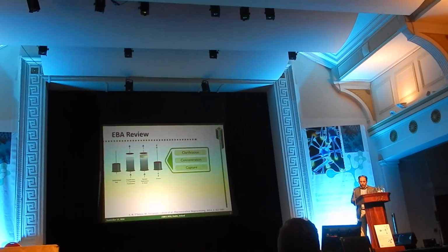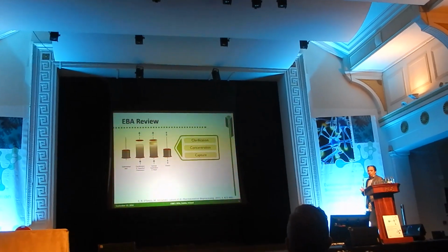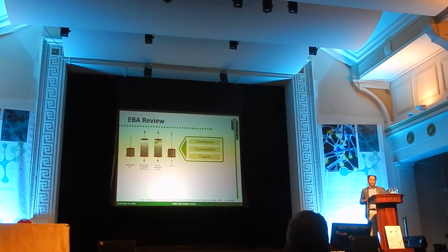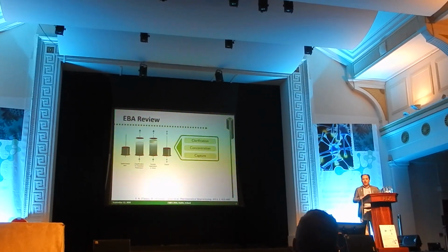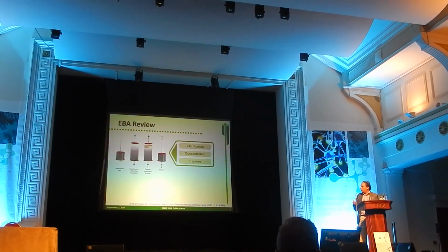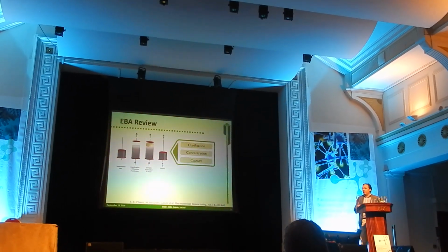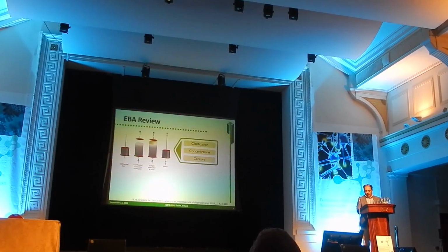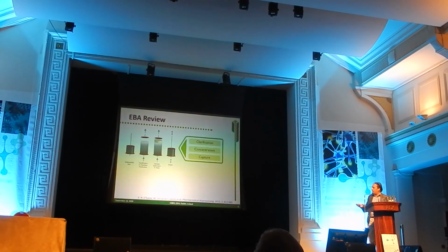So the direct consequence of this way of operation is that now we can at the same time remove solids, so there is a clarification effect, as you see here. There is also a concentration effect because we normally feed the system with several volumes of feedstock and then elute in a few volumes, so there is a concentration. And there is also, of course, a more or less selective capture of a certain target molecule, depending on the affinity of the material itself, which, by the way, can be operated in any chromatography mode, as you already know.